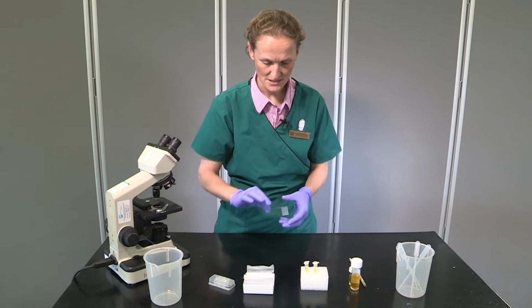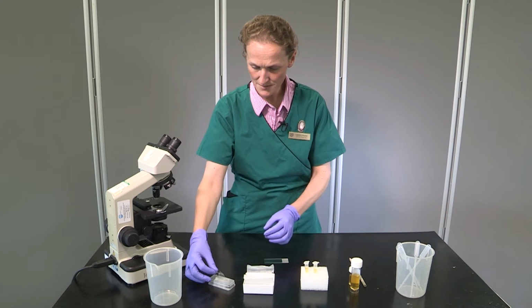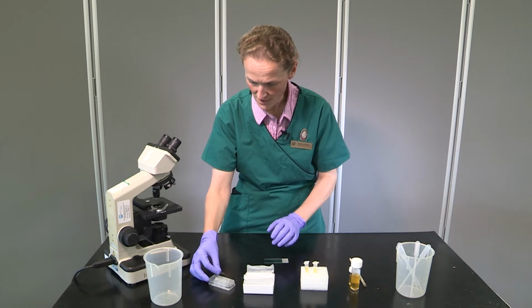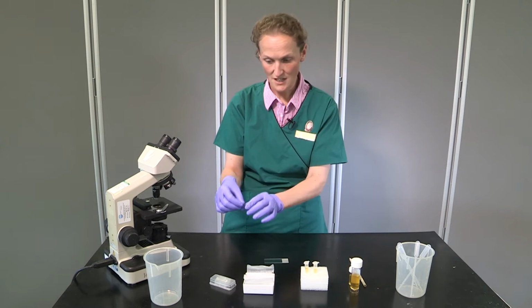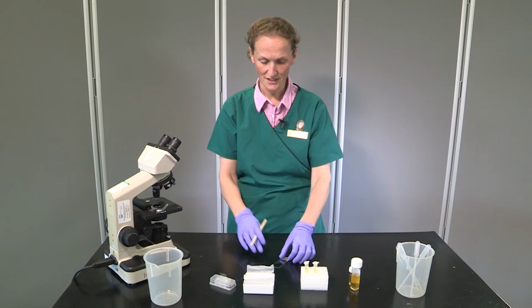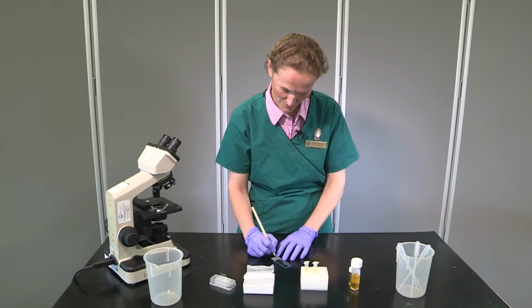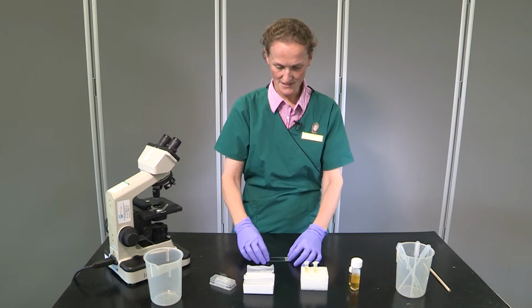So first of all I'm going to take myself a microscope slide. I'm going to pop out a cover slip so that I can get it later. I've got my clean gloves on just now, but after I've handled the urine I don't want to touch any of the slides that are inside this pot, so I'm just going to pop it there. I'm actually going to label the slide just now, just because my gloves are clean and therefore I'm handling a clean pencil. And now I'm ready to make a start.